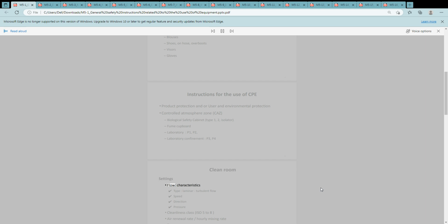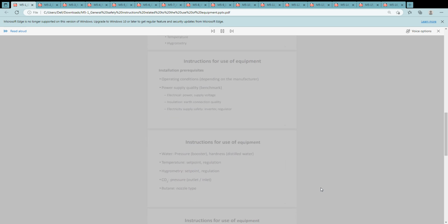Settings: flow characteristics, check type, laminar, turbulent flow, check speed, check direction, check pressure, cleanliness class, ISO 5 to 8, air renewal rate / hourly mixing rate, temperature, hygrometry.